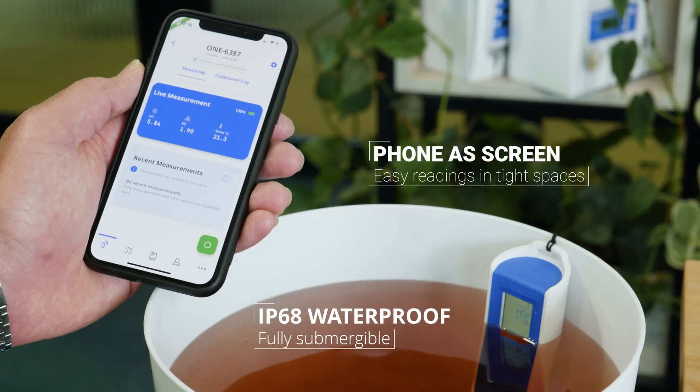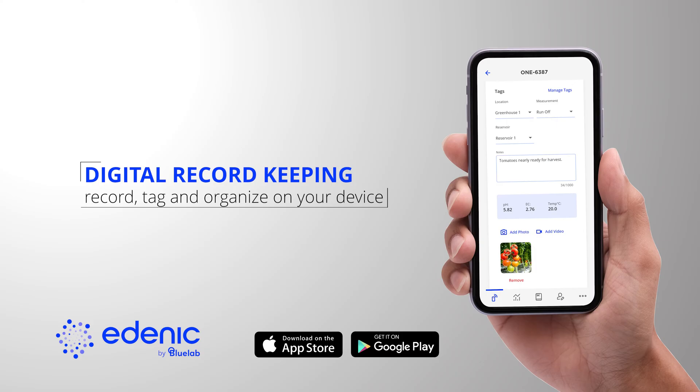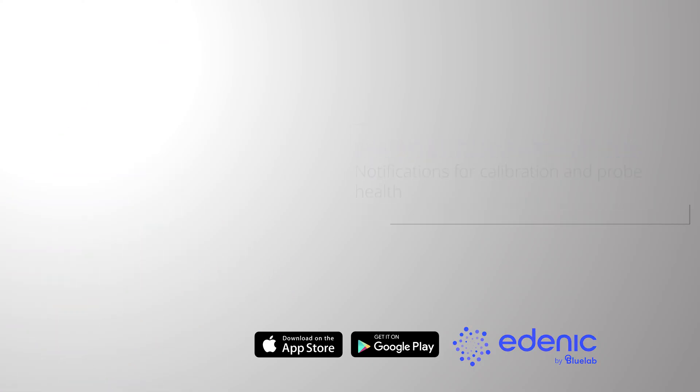Use your phone's screen for easy readings in tight spaces. Ditch the pen and paper — record, tag and organise all your measurements with photos and videos. Receive notifications for calibration and probe health, ensuring optimal performance.